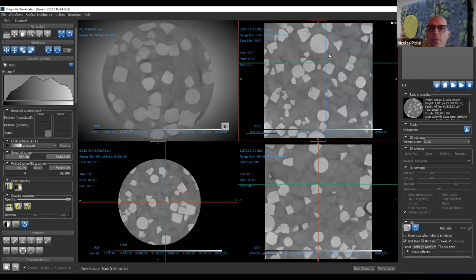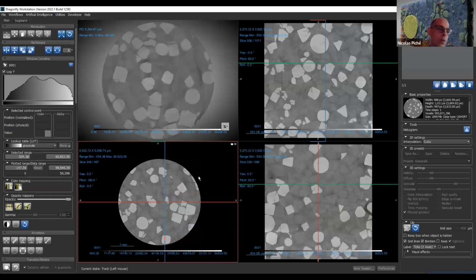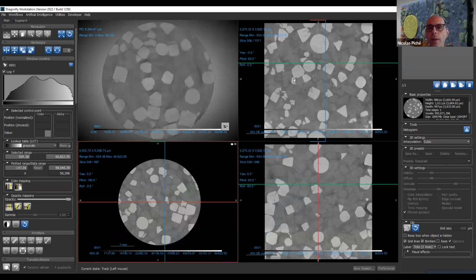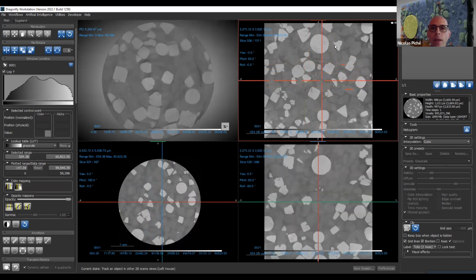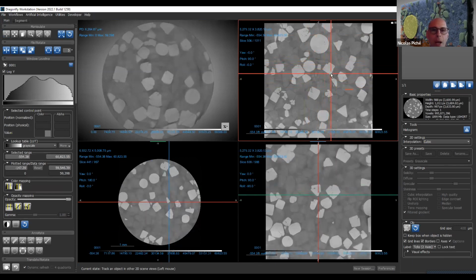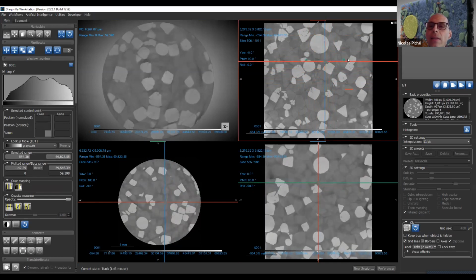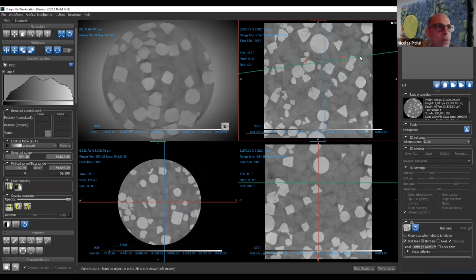Sorry, my mouse is a bit new. So sorry about that. This is weird. Okay, so I can change like that. Also, something practical: when you double click on a view, it maximizes. Double click again, it minimizes. Okay. If I click on the middle of the cursor, I put the three views at the position I specified there. If I select one like this, you see that there's a little triangle that appears. This is to change the obliquity of the associated view with the line on screen.